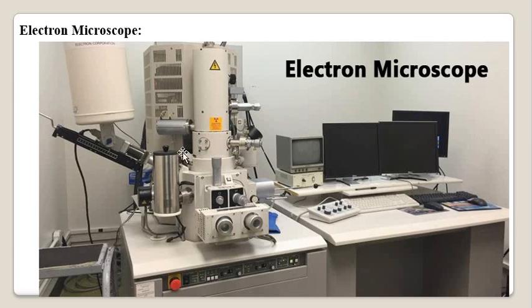Then vacuum pumps are there, because whenever we're going to run the electron beam, vacuum must be there. So vacuum pumps are there. The electron microscope requires a vacuum inside the microscope column, right? Inside this microscope column, this is maintained by diffusion pumps or ion pumps, which can evacuate the column so that the electrons can be run.